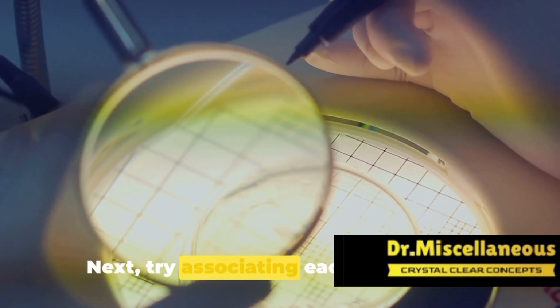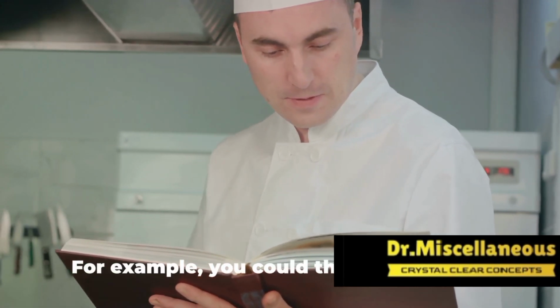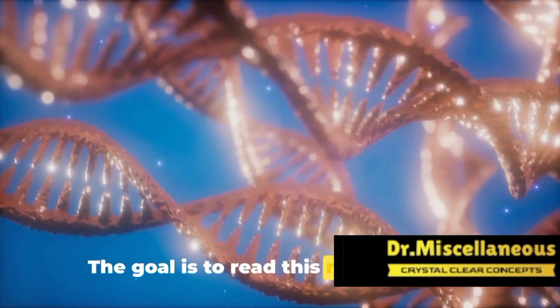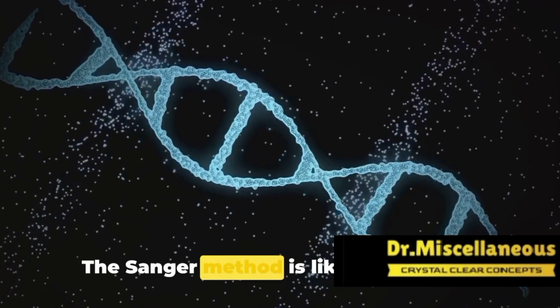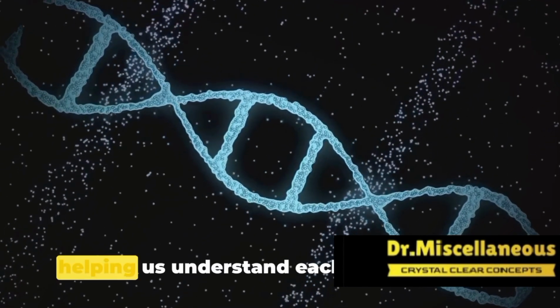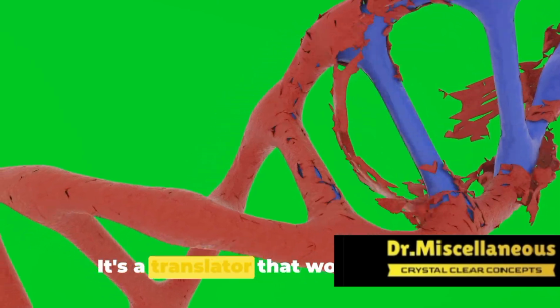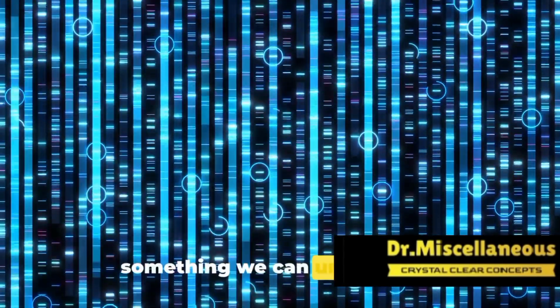Next, try associating each step with a simple analogy. For example, you could think of the DNA as a long, complicated recipe. The goal is to read this recipe, but it's written in a language we don't understand. The Sanger method is like a translator, helping us understand each ingredient and cooking instruction. It's a translator that works letter by letter, translating the DNA language into something we can understand.